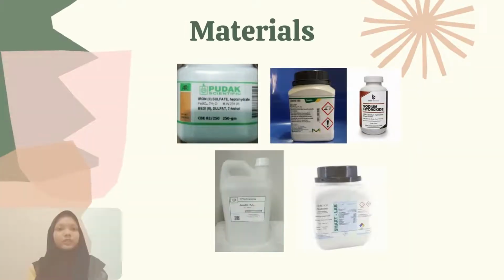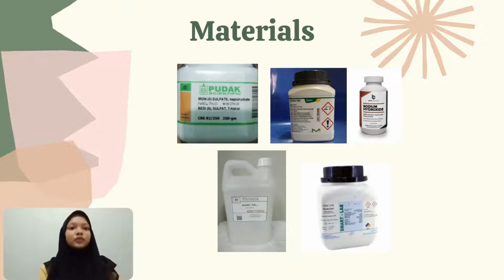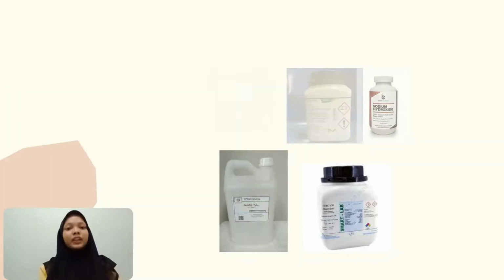The materials used in the practicum are iron 2 sulfate heptahydrate, ferric chloride hexahydrate, sodium hydroxide, distilled water, citric acid, and magnetic stirrer.